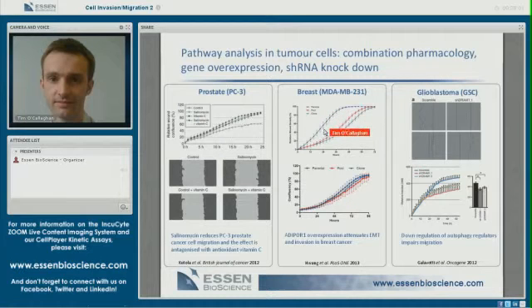They showed that overexpression actually reduced the rate of invasion of breast cancer cells into a Matrigel matrix, and also attenuated epithelial to mesenchymal transition. The team also used IncuCyte to monitor the growth effects of overexpression and showed that the overexpressing cell types showed no significant difference in growth compared to the parental controls.